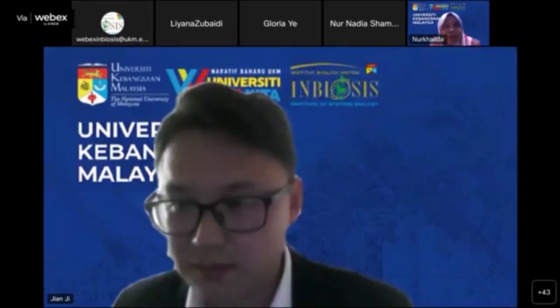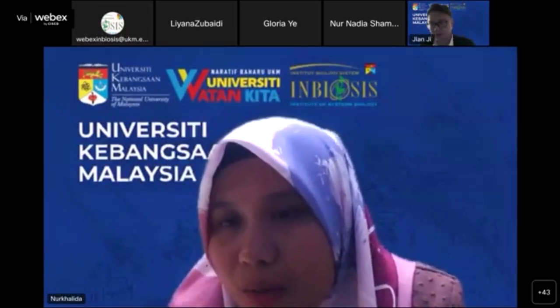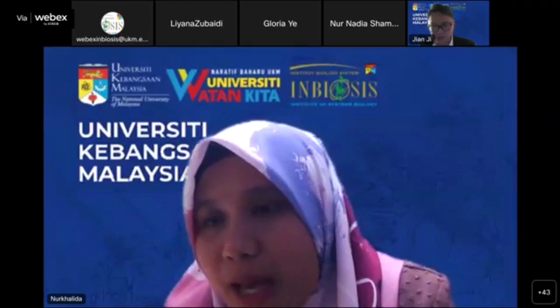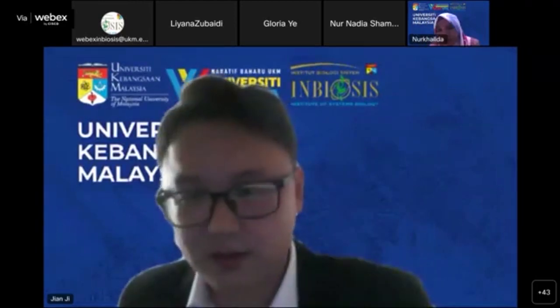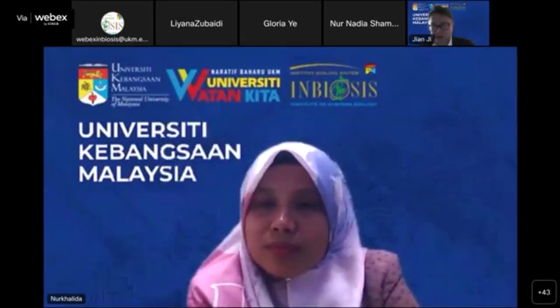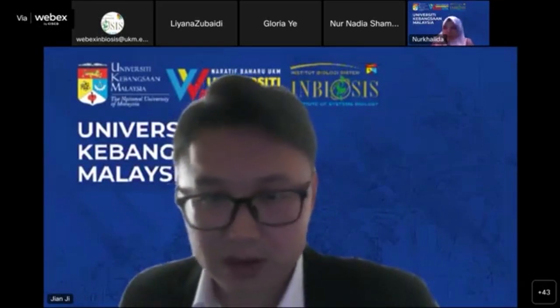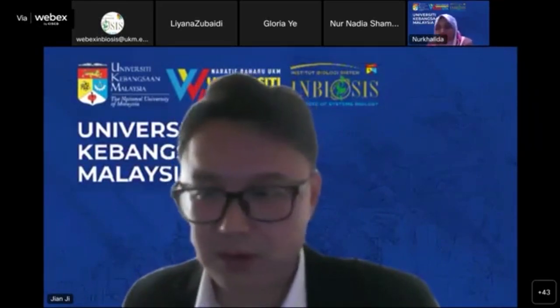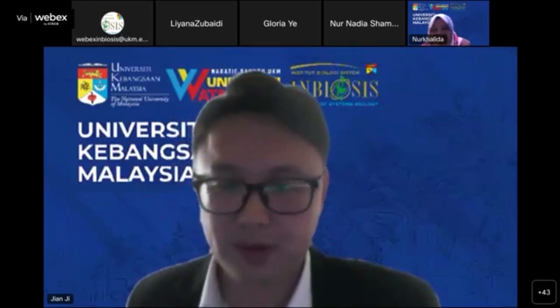All right. The third question: how to reduce artifacts or byproducts due to the TMS derivatization? Yeah, it's a very important question. I think the artifacts can be removed very easily, but the byproducts cannot be, because when we do the TMS derivatization, it will generate lots of products.